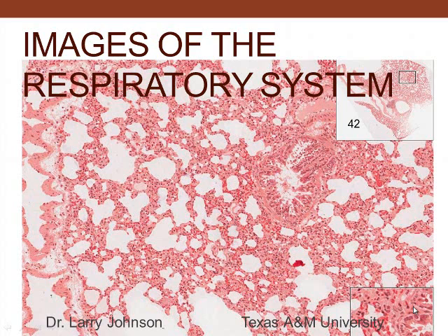Hello, today we're going to look at the images of the respiratory system. We will go through the respiratory tract, starting out with the nasal cavity, ending up with the lungs, and talk about the cells that are along the way and some of the functions of the cells, and we'll actually walk through the images that we have to look at in lab. Hope it's useful. Images of the respiratory system.